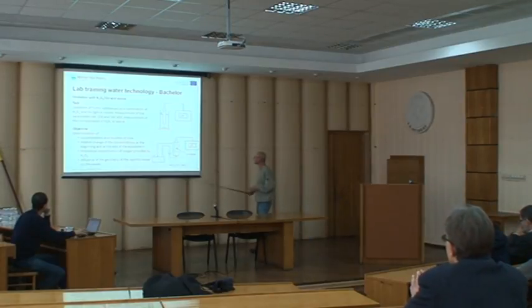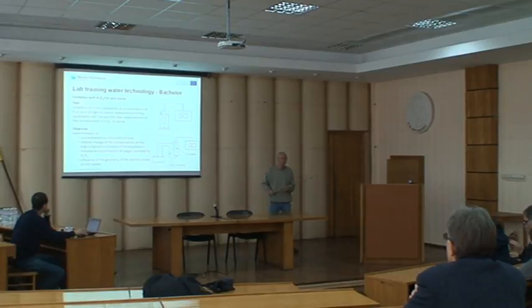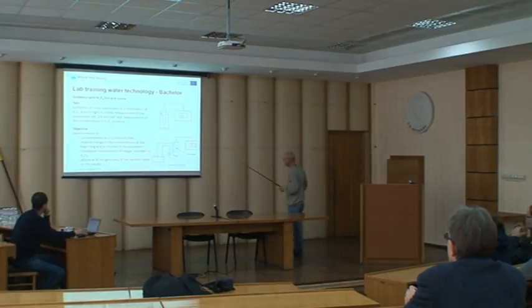And another task, which is not shown here, is oxidation with ozone, which is more aggressive, which is more dangerous, of course. But the results are being compared after that lab training for the oxidation of organic substances.